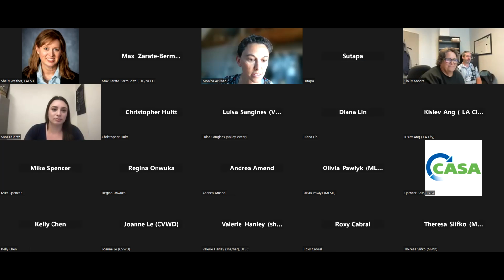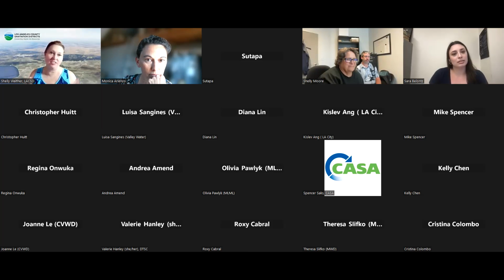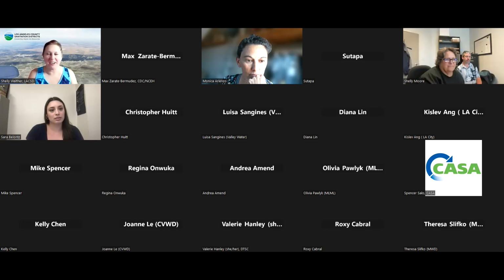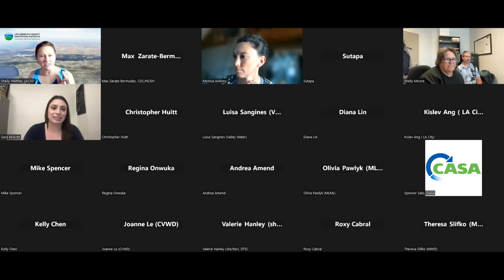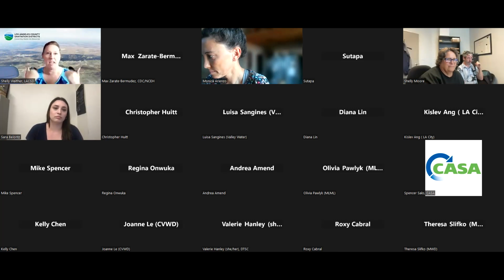Shelley, you had your hand up next. Yes, thank you for your excellent presentation, Sarah. I was curious, especially in context coming right after Harry's talk, when you take the 80 microliter drop of sample and scale it up to number of particles per liter, can we talk about the representativeness of the sample size? Was it purely just numbers that you scaled up to that higher volume, or how many samples, how many drops were analyzed to come up with that number?